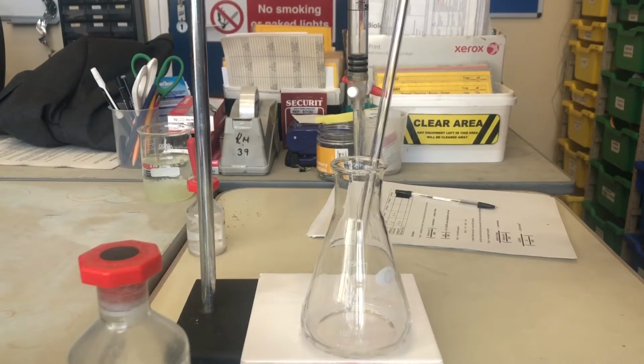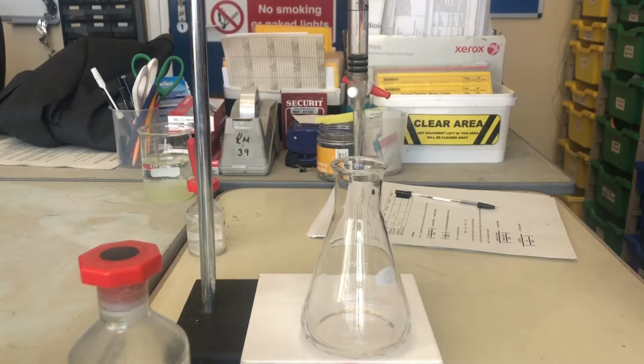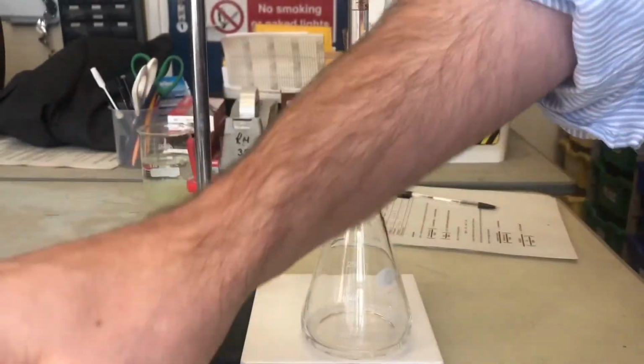There'll be 2 drops left in the bottom. Now we need to get one of those out. The other one stays there because that's measured into the reading on the pipette. So where we get the one out, we just touch it on the surface of the water and it drags out that 1 drop. So that's the sodium hydroxide in the conical flask.